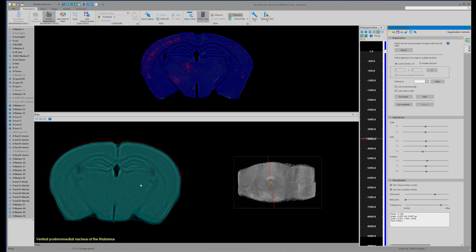And so we do that by a couple of things. One is that we can move this so we can see an overlap, and now we're going to use the adjustments. What we're doing is adjusting the Allen space. You can change the scale. When I talked before about the scale, even though we've calibrated the atlas to that, we can make adjustments in individual cases.